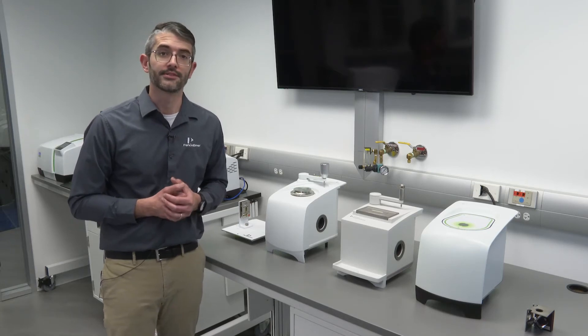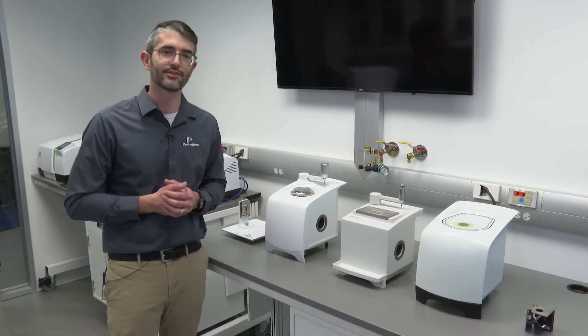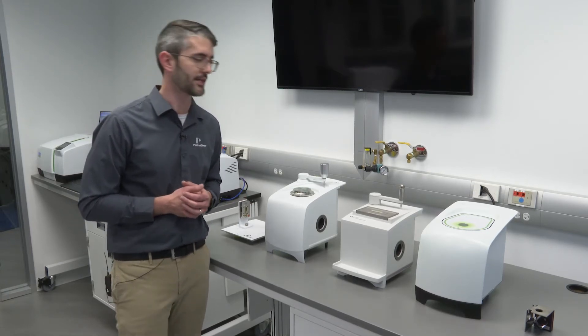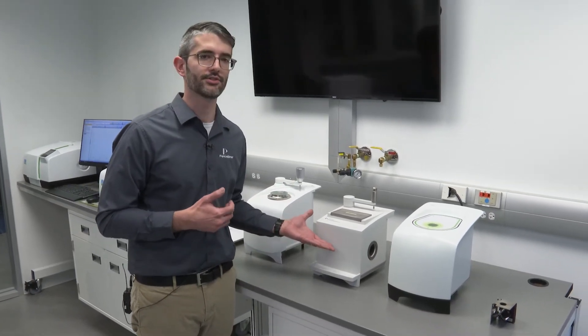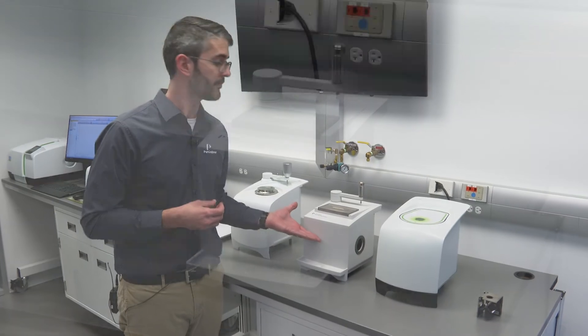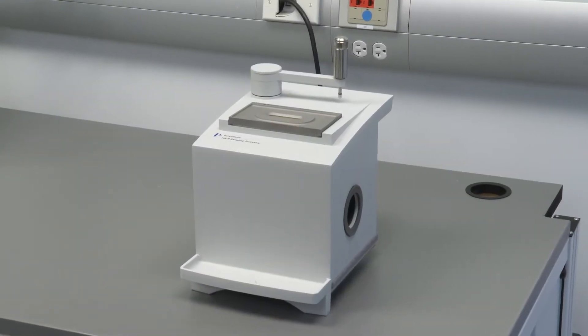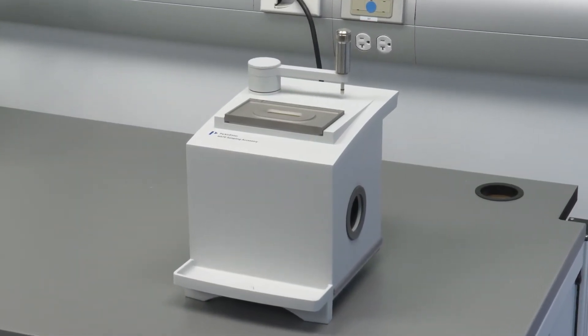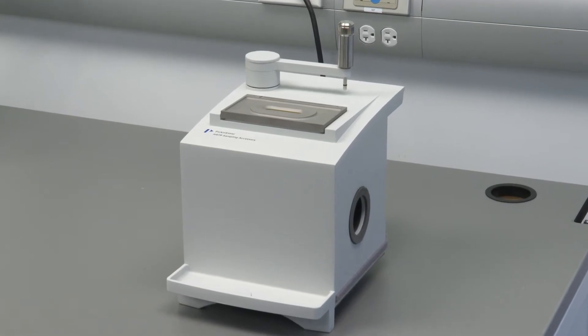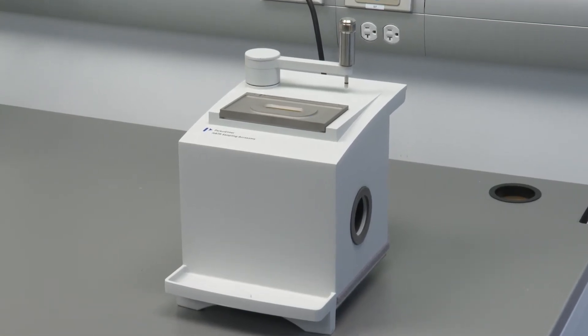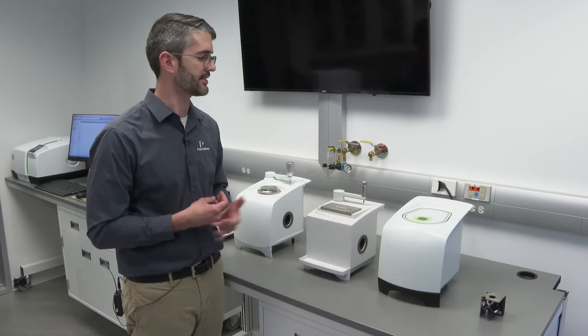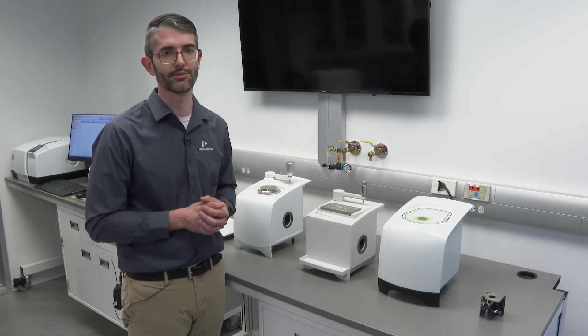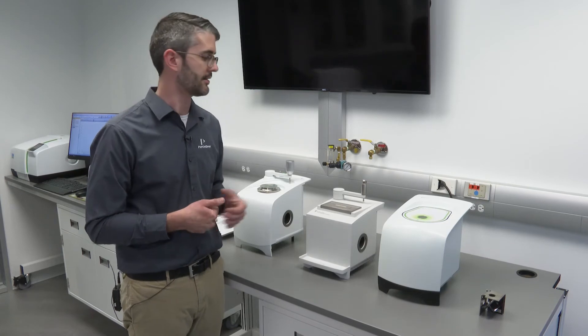With those options, if that does not provide sufficient sensitivity for the sample or the parameter of interest, you may consider switching to a horizontal ATR. The horizontal ATR allows many reflections to occur between the sample and the ATR crystal itself. With these many reflections, the sensitivity is further enhanced because there is additional interaction between the sample and the infrared light.